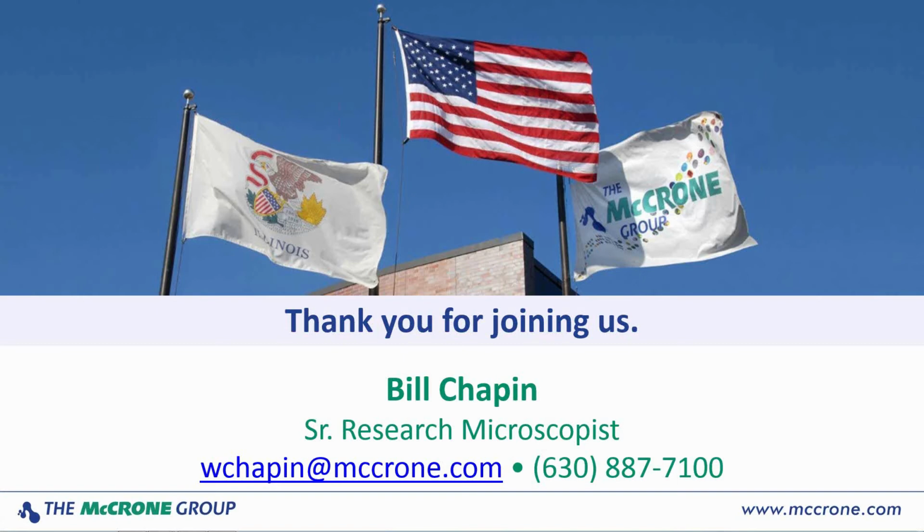Pierce asks, can coaxial illumination be added to a scope in the field, or is it too difficult to do? That is a function of your scope. I don't know what brand scope you have. Any of the Olympus equipment, it's very simple. I believe any of it, it's fairly simple to retrofit. Some of the other brands may or may not be.